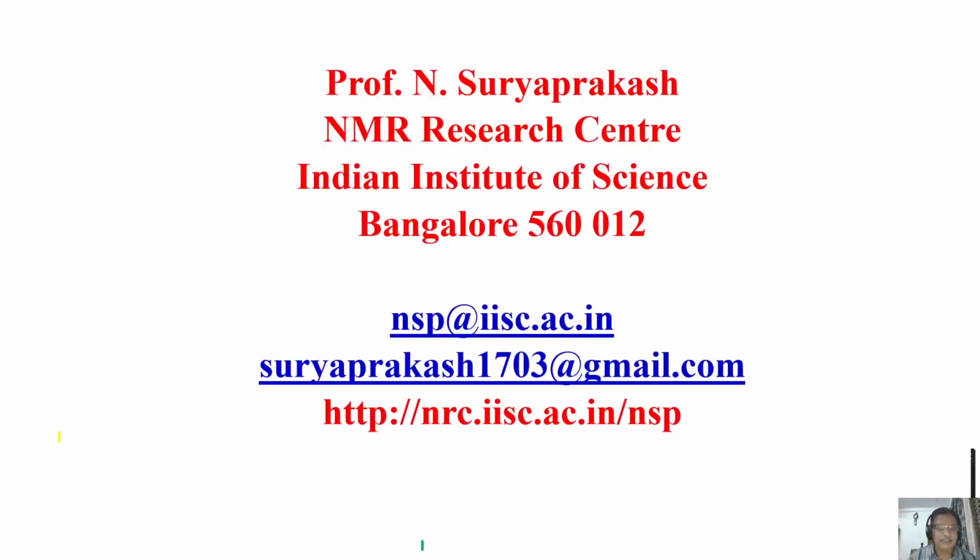So in the last class, we started discussing spin echoes, which are very important in understanding the spectra. I wanted to see what is going to happen in the heteronuclear case when I apply a spin echo sequence on carbon-13. At the same time, I want to see the decoupling of proton and see what is going to happen. Of course, I was trying to explain what happened to this pulse sequence based on the vector diagram.